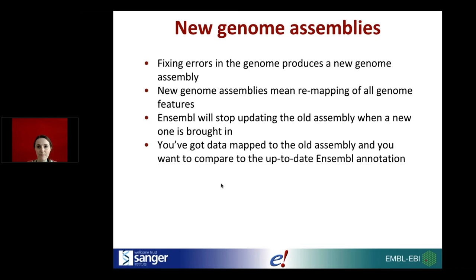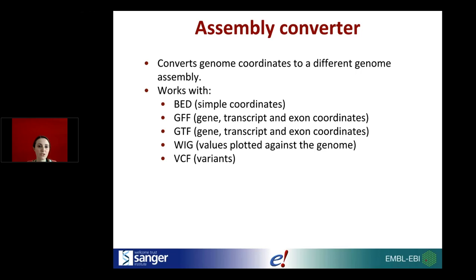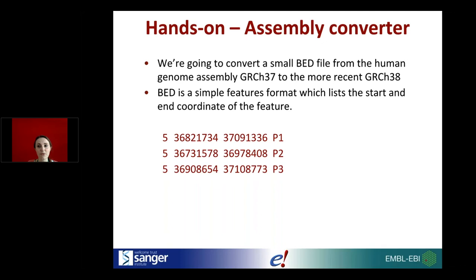If you want to use up-to-date annotation but compare it to data you've mapped to the old assembly, this is when you might want to convert your data. The Assembly Converter converts genome coordinates to a different genome assembly. It works with BED (simple coordinates), GFF and GTF (gene, transcript, and exon coordinates), WIG (values plotted against the genome), and VCF files (variants). I'm going to convert a small BED file from GRCh37 to the more recent GRCh38.